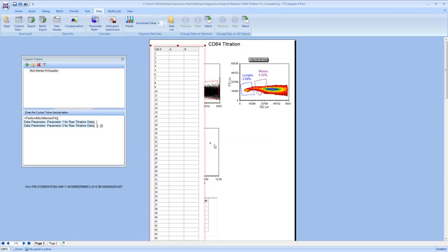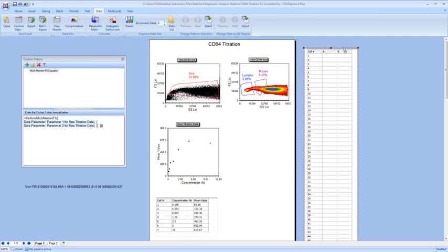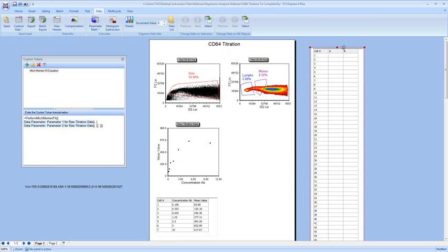Alright. And now we have this blank data grid. And what we want to do is fill this with, first, I guess, x values from 0.1 to 12 in increments of 0.1. So to do this, let's do what we call parameter math in the software, so we don't have to fill this table in by ourselves. That'd be grueling and boring.